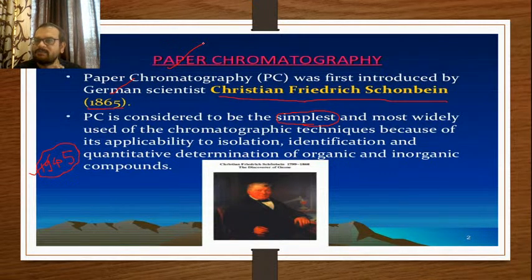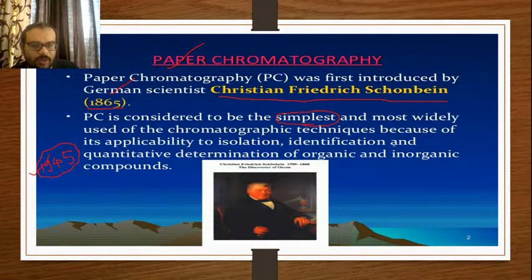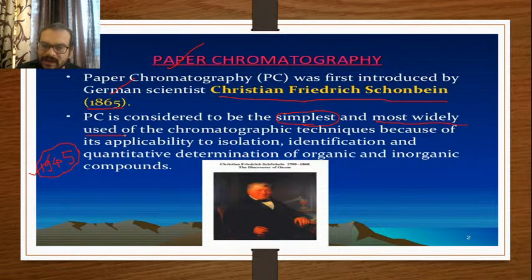But this is not a prerequisite in paper chromatography, because it is a simple technique, simple to handle, and hence the most widely used. No need to explain why it is most widely used, because of its simplicity and wide acceptance.